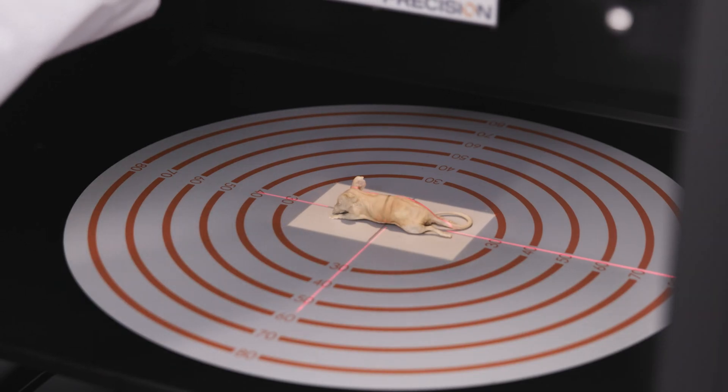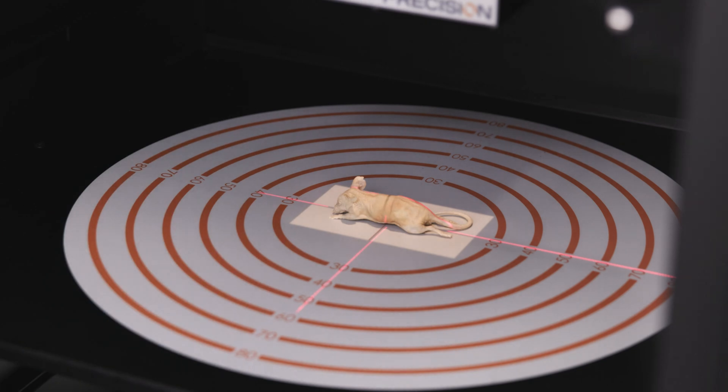Additionally, a laser crosshair aids users to easily find the center of the irradiation field. The X-RAD is the only system that can irradiate up to 33 mice at one time.